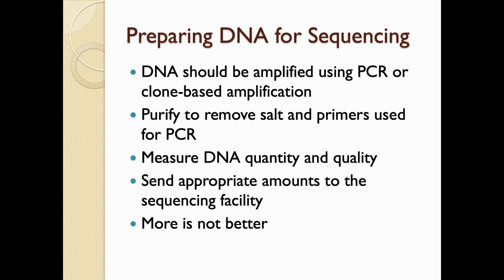Before sequencing, DNA must be amplified either by PCR or cloning. Then it's purified to remove salts and primers. Then you need to accurately quantify DNA before you can send it for sequencing. Too much or too little DNA can affect the results.